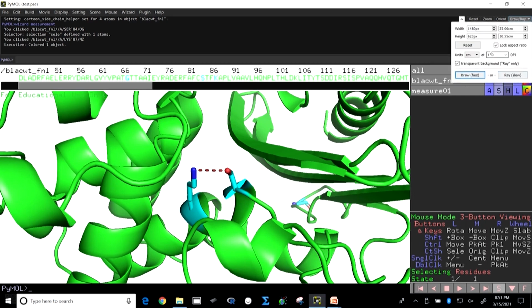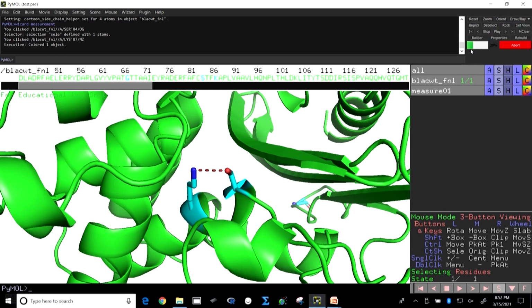So, as I talked about, we want to save it. If you see now, you change the parameters, the DPI values and all, so that you could make a high resolution picture. See the rendering happening.